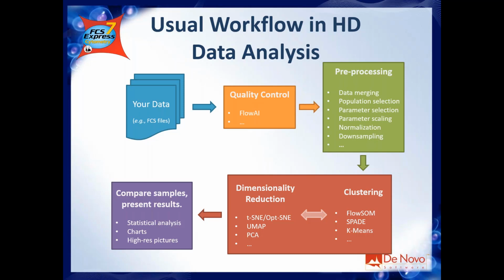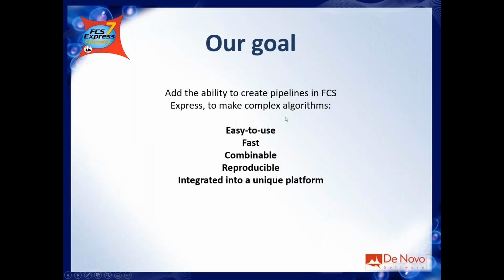And then, of course, at the very end, you want to put together the results and make some presentation, some publication, and so on. So you can really see that this is a very good example in which you can apply a pipeline, because more or less you are always going through the same set of steps. Now, this was our goal. We wanted to implement pipelines to make complex algorithms very easy to use, thanks to the PowerPoint-like user interface in FCS Express, and very fast.